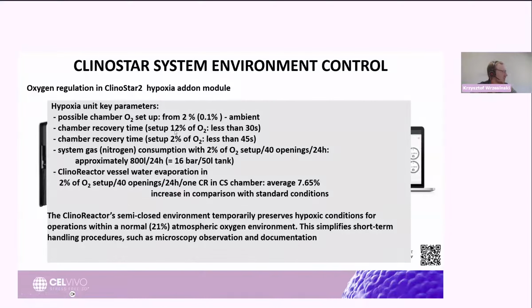If you have a setup of 12% oxygen, you will get a 30 seconds recovery time after you have opened the system and exchanged the atmosphere to standard levels. If you do the setup of 2%, you will have 45 seconds or less than 45 seconds of recovery time.